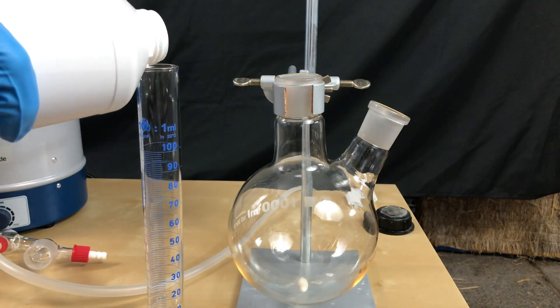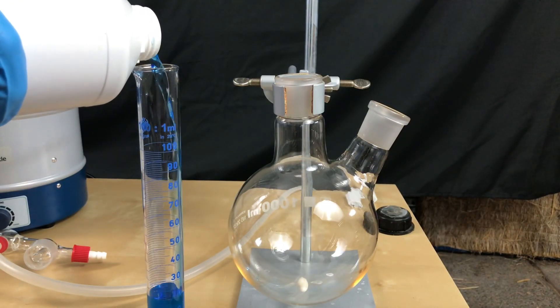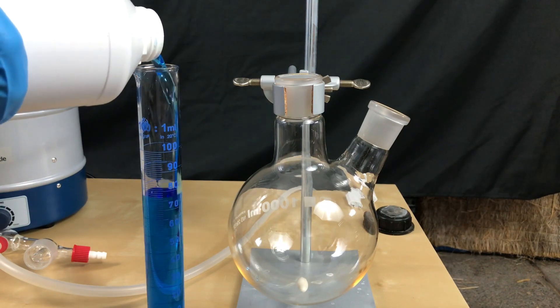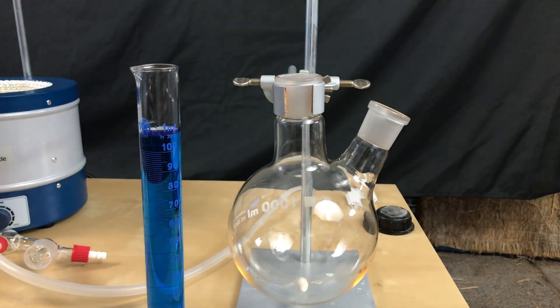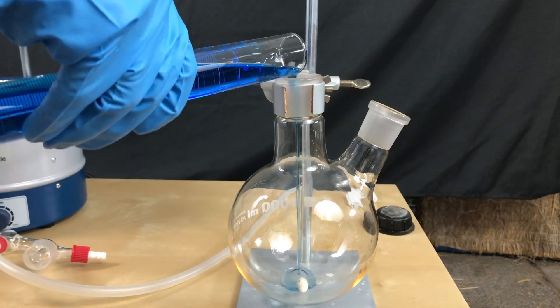We start off by measuring out 650 milliliters of our ethylene glycol. The ethylene glycol is poured into a two neck round bottom flask.